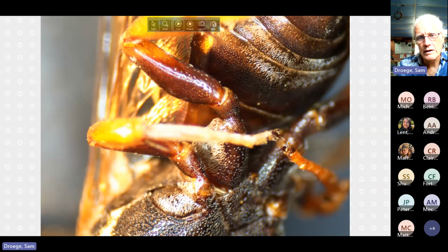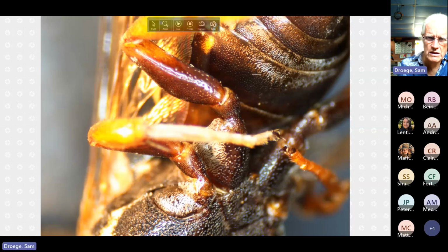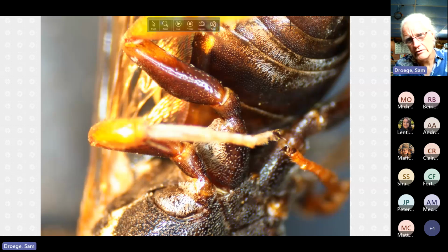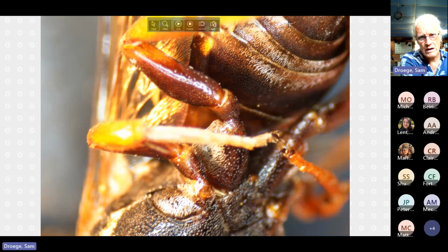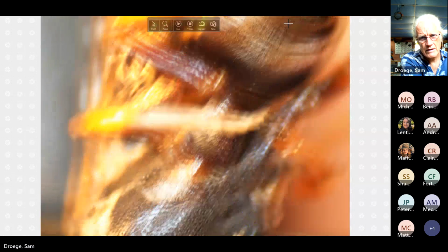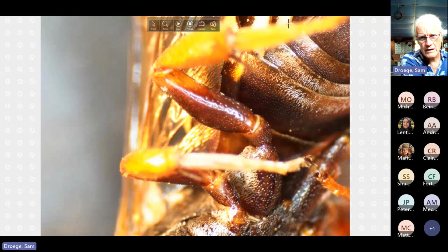But here you can see white hair bands, white appressed prone hairs here and here. And so this is S2, S3. Here's S4, absent in the middle, but present at the lateral side. So many, many times, if I recall correctly, you'll find that these hairs are there, but only at these lateral edges.